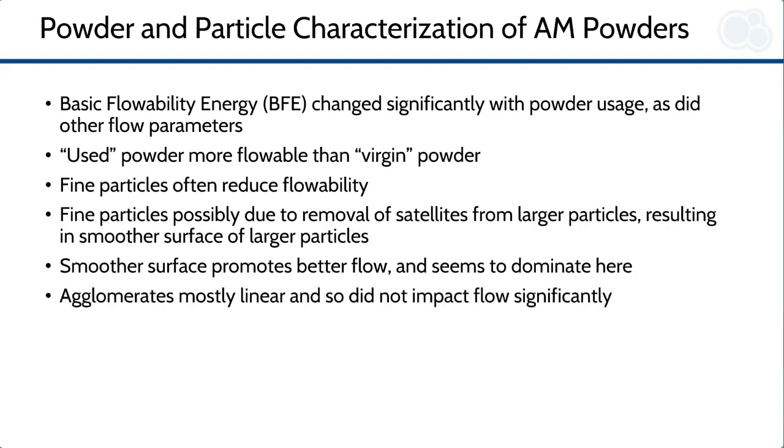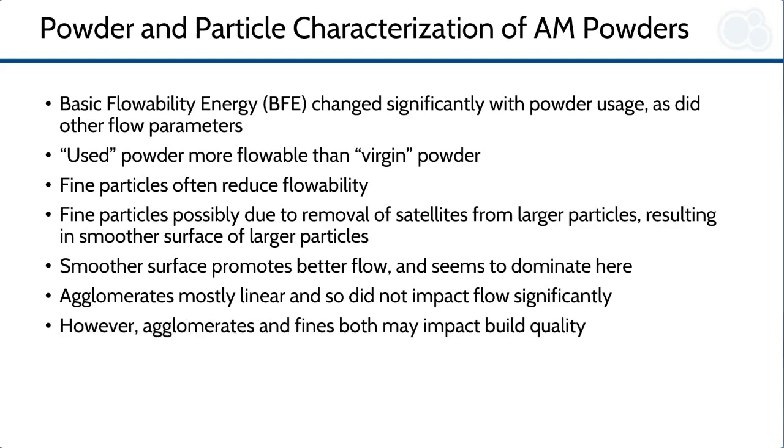Since agglomerates of two particles tend to form a linear combination, there does not seem to be much impact on flowability with these particles. Remember, though, that agglomerates as well as fines may impact the quality of the printed part, and though not impacting flow, may still be significant when it comes to the use of recycled feedstock.